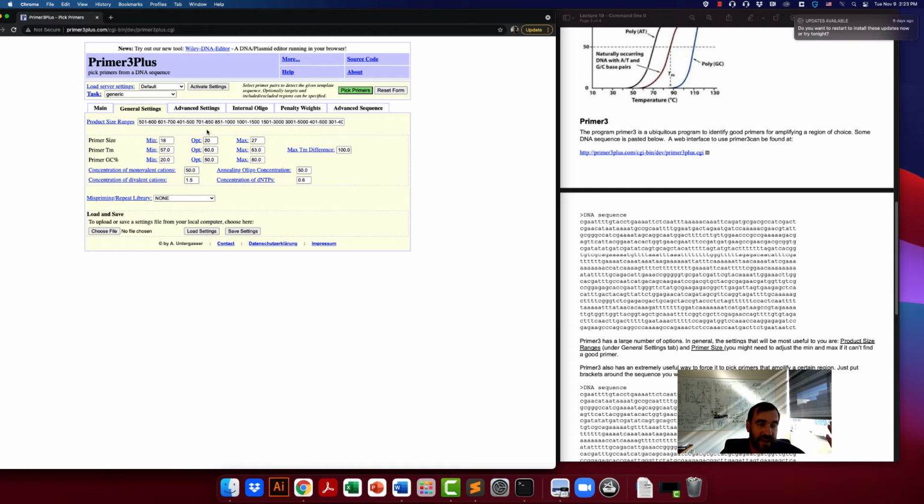So why might you do that? The longer the base pairs, the longer the oligo is, the more expensive it is to produce it. So you might want to try to design something that's shorter for that reason. You can also specify things like GC content, and that also goes into the choice of primers. So it might try to optimize at 50% GC. So 50% of the nucleotides are Gs or Cs, and 50% are As or Ts.